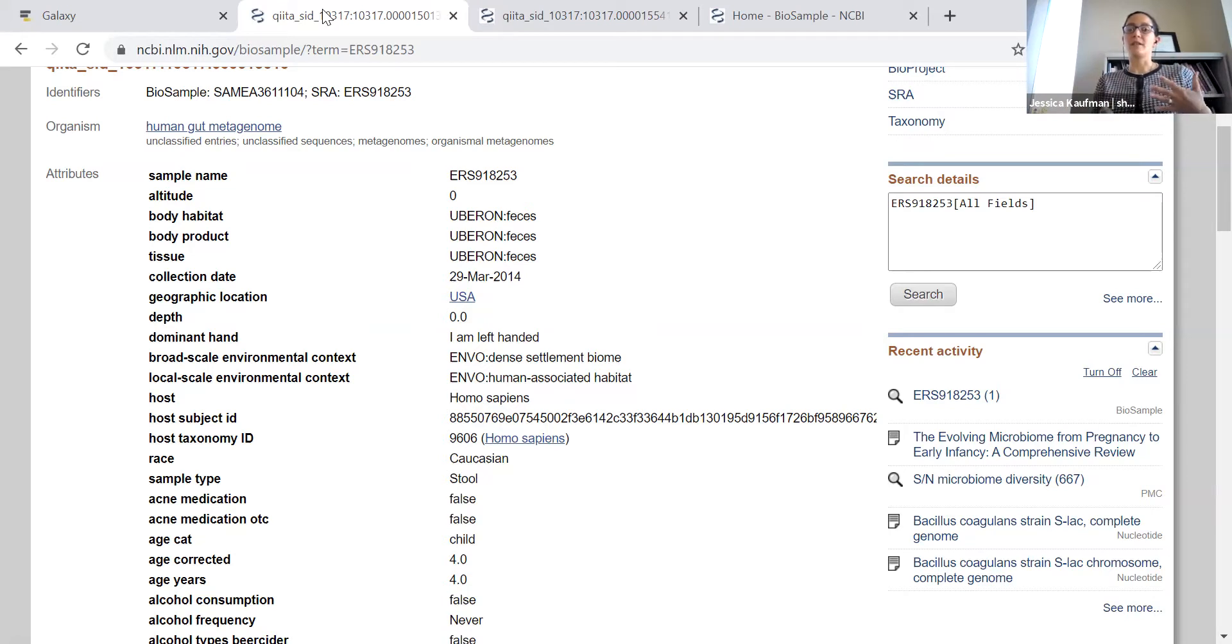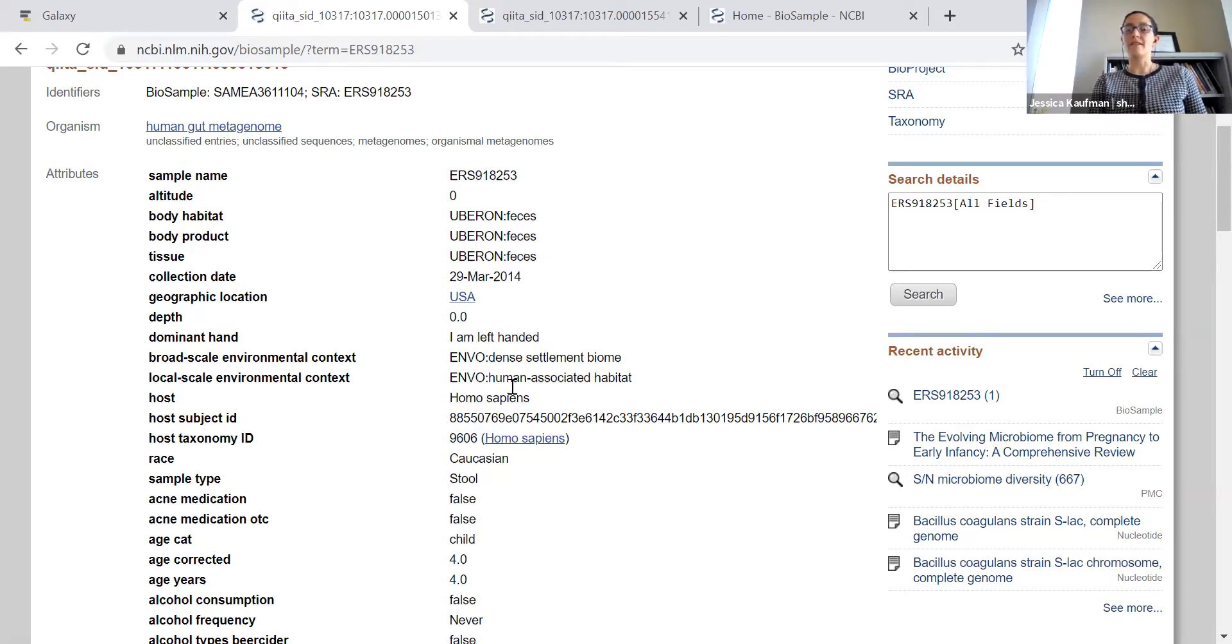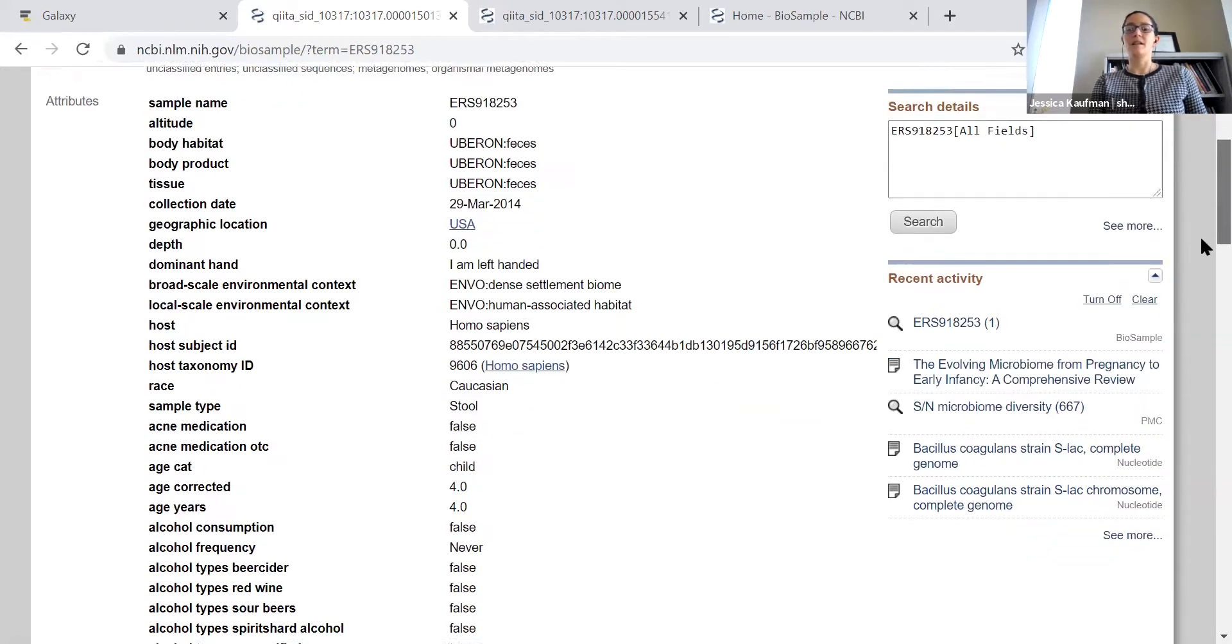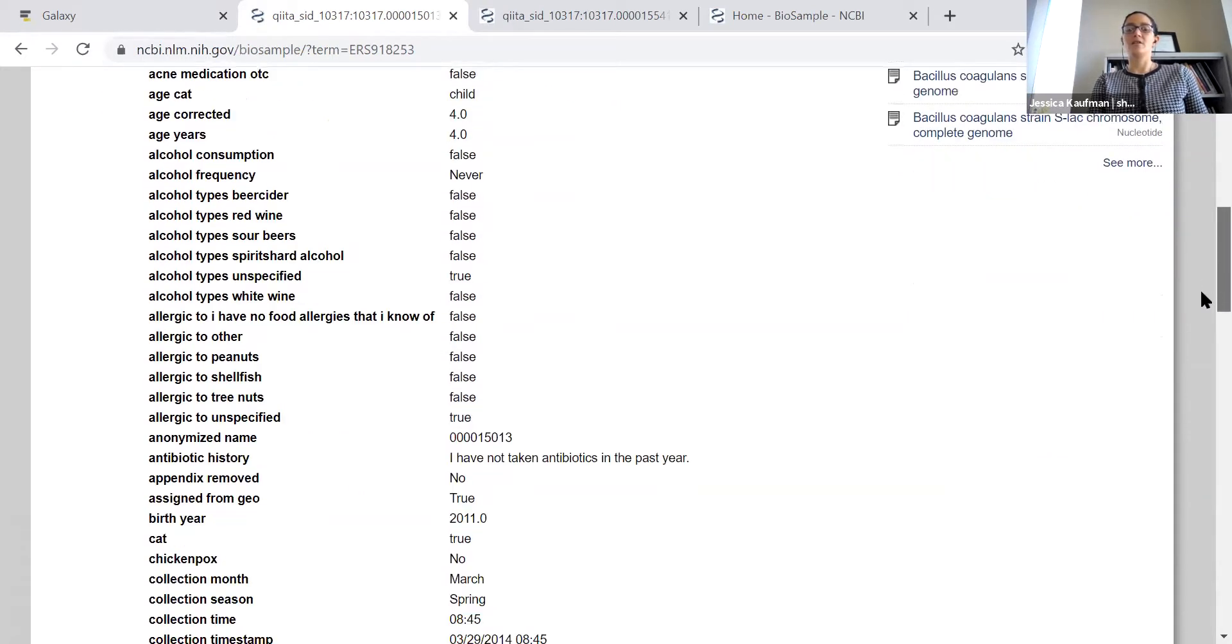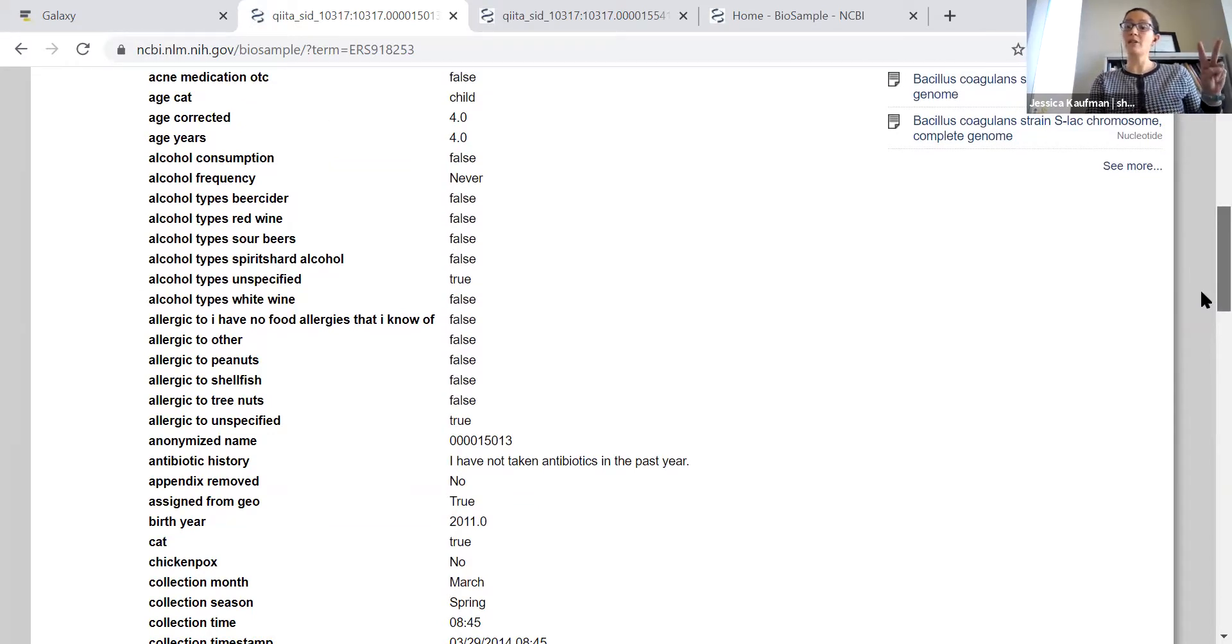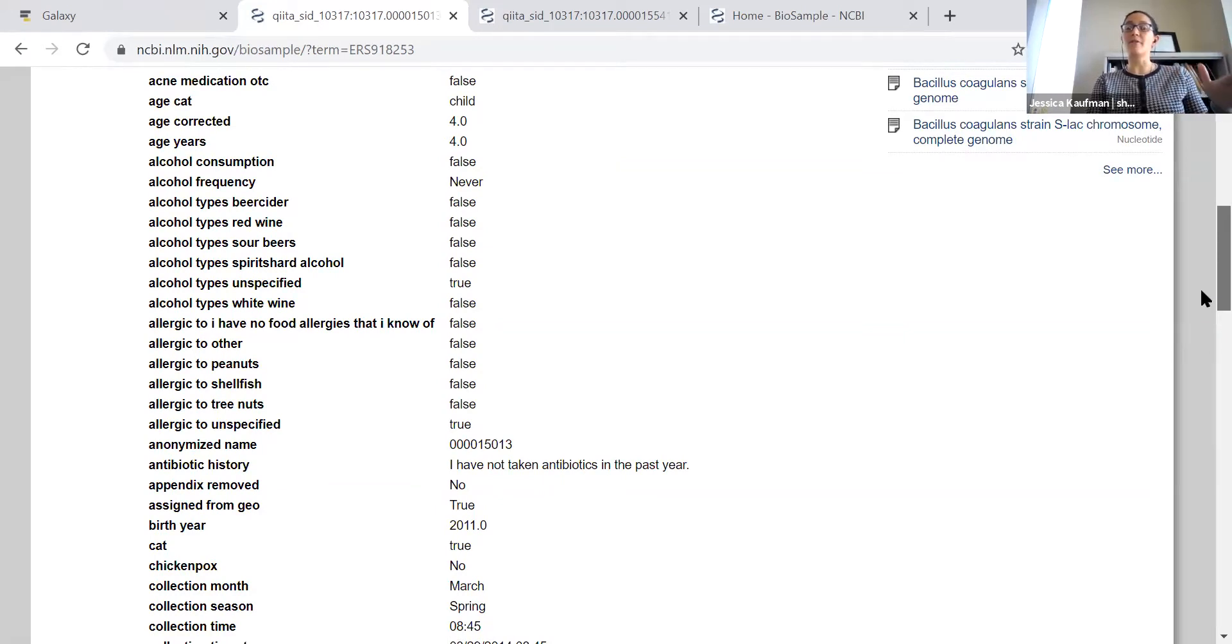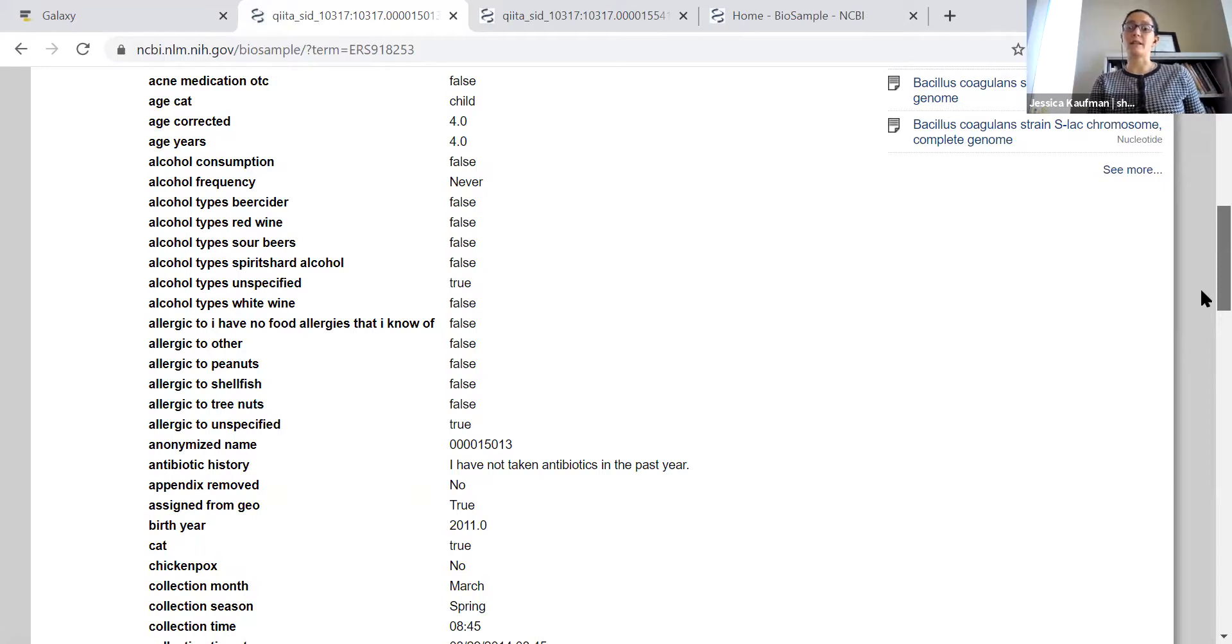This is a sample taken on March 29, 2014 from a four-year-old male child who's left-handed and lives in a dense settlement biome. There's lots of questions in this survey. I have varied the age between my two samples, and I'd like everyone in the class to pick some other question, not age, to vary between their two samples.